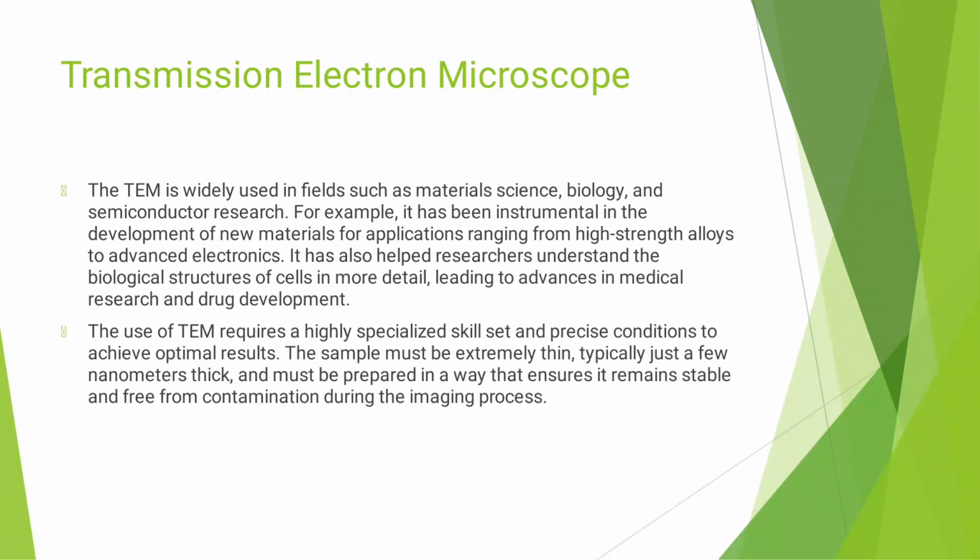This TEM is widely used in the fields of material science and biology. For example, it has been instrumental in developing new materials for applications ranging from high strength alloys to advanced electronics. It is also used to study the biological structure of cells in more detail. The use of TEM requires highly specialized skill and precise conditions to achieve optimal results. Especially, the sample should be very thin, in the size range of a few nanometers only.